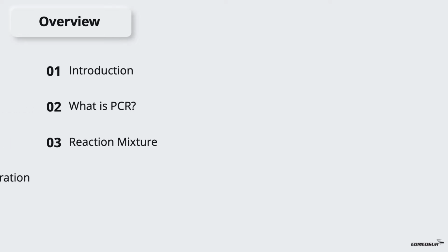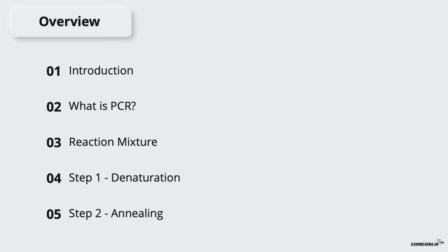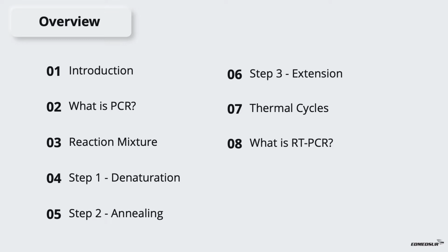RT-PCR RNA amplification will be considered under the following headings. Introduction. What is PCR? Reaction mixture. Step 1. Denaturation. Step 2. Annealing. Step 3. Extension. Thermal cycles. What is RT-PCR? And reaction mixture.